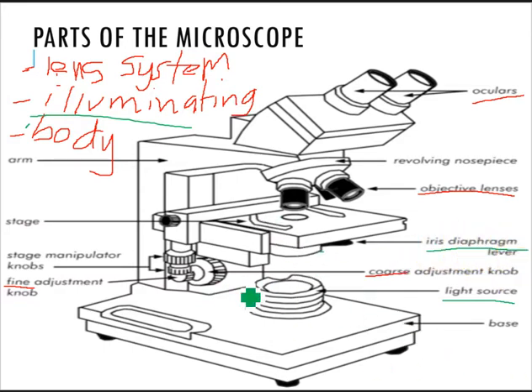Basically, in the picture there's no condenser, so what's missing is your condenser, but it is somewhere here.